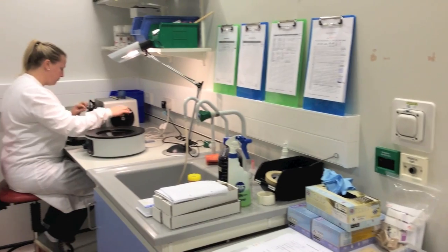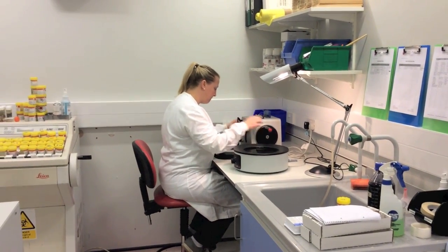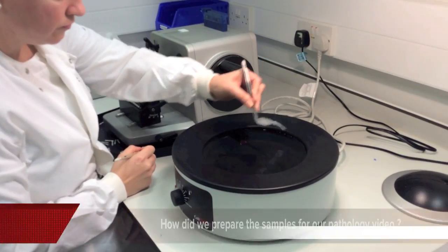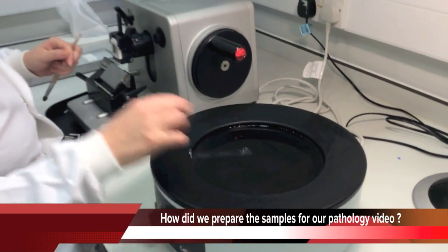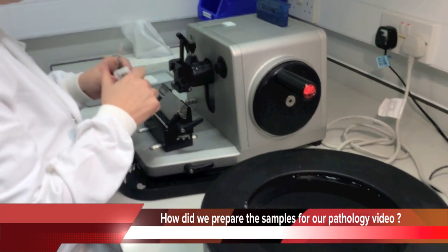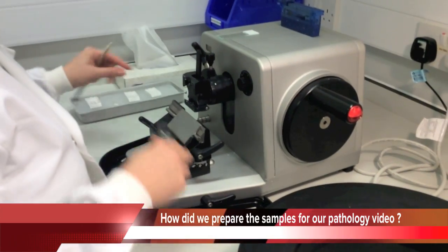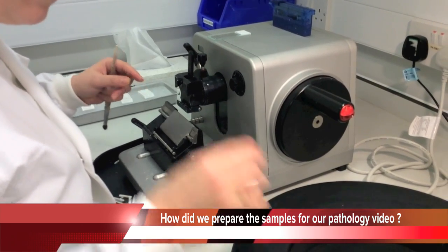Some of you requested more detail on how we stained our liver specimens in the video with Stefan Hupscher, so we'll show you how here. Here, one of our pathologists, Melissa Wardale, is cutting a block of tissue which is prepared in wax into very thin sections. These are less than the thickness of a human hair. They're then floated on water in the black water bath you can see to the right, so that she can pick them up and individually place them onto microscope slides.